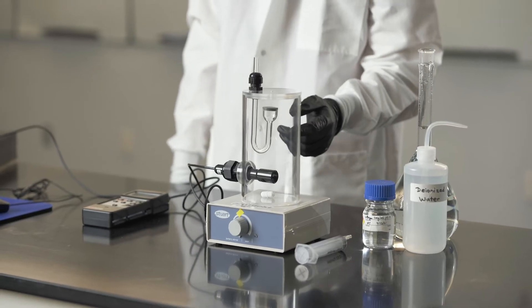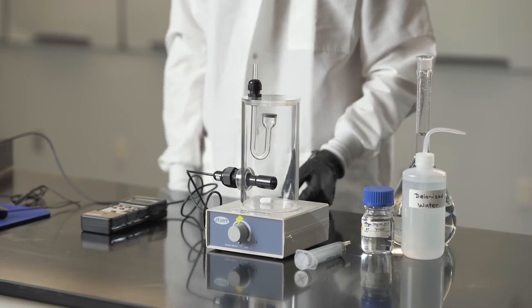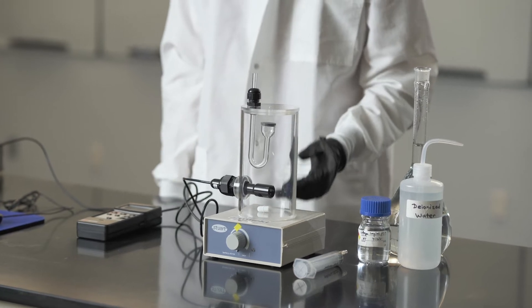The diffusion cell is a glass U-shaped vessel. The lower end is larger and it is sealed with a disc that contains small capillaries.